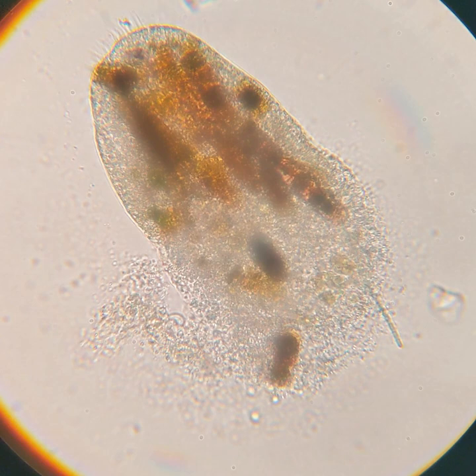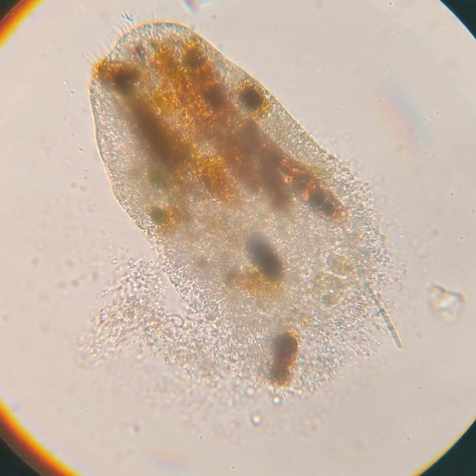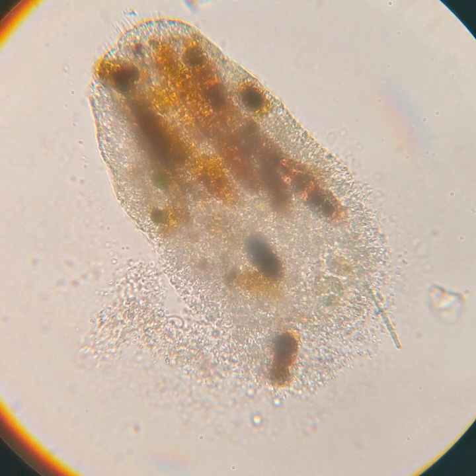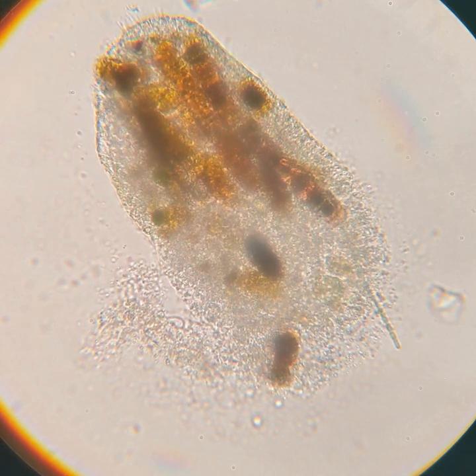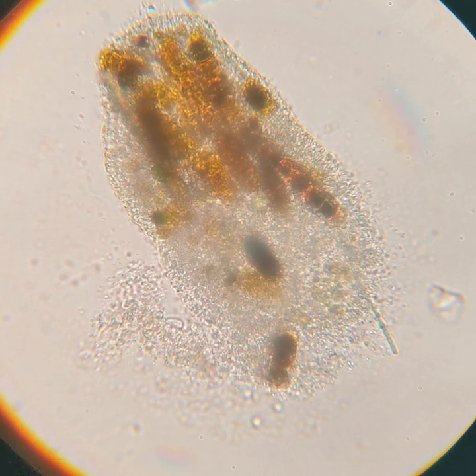In fact, you can see some of the food remaining in this little guy as he completely comes apart. Mostly what we're seeing here are different types of algae and bacteria. This guy's membrane is now completely gone, as you can see, and the cell has died.